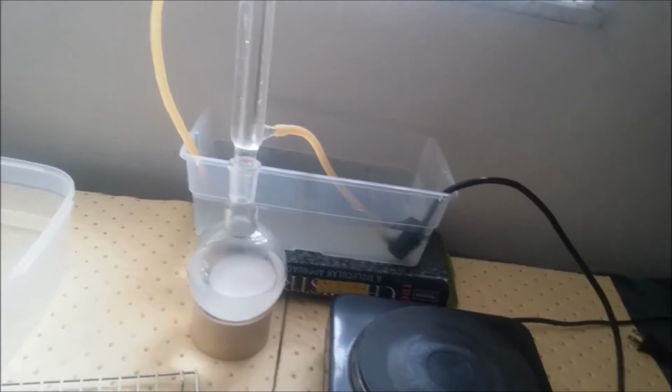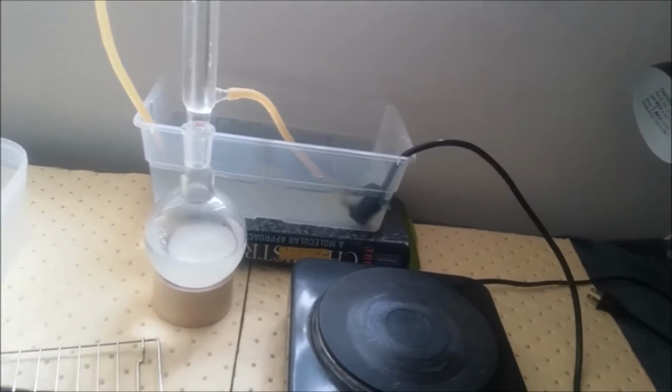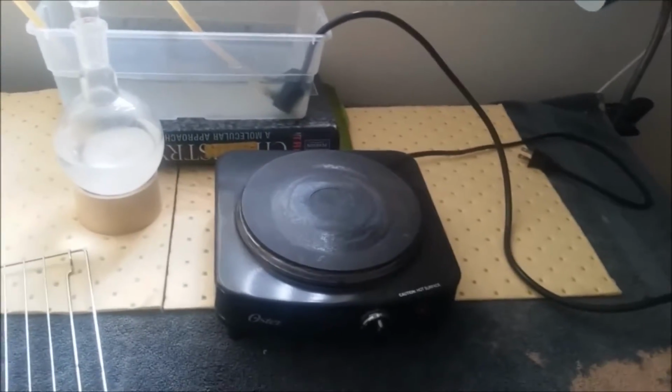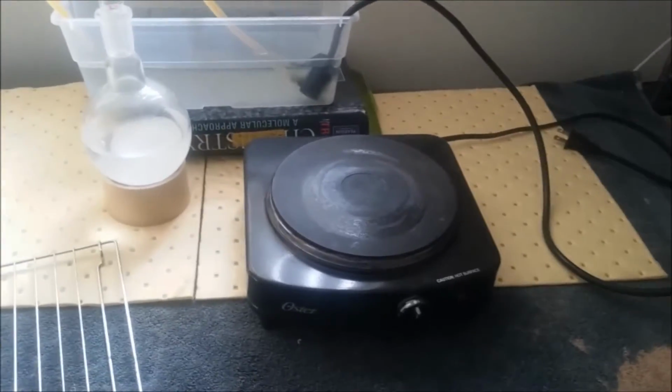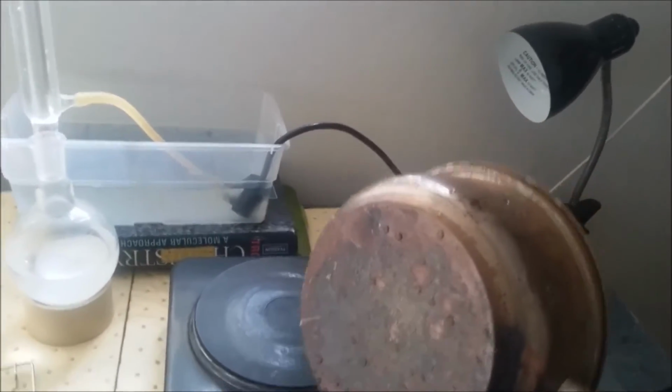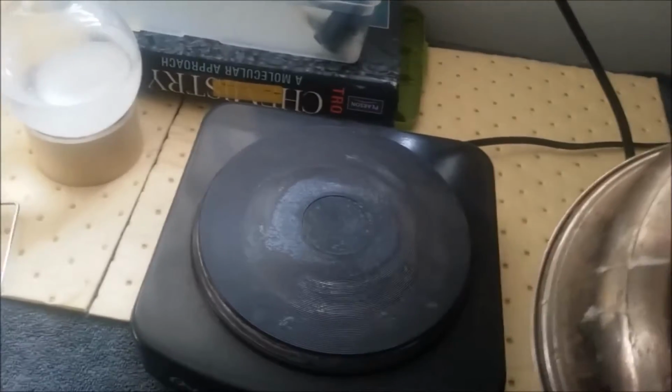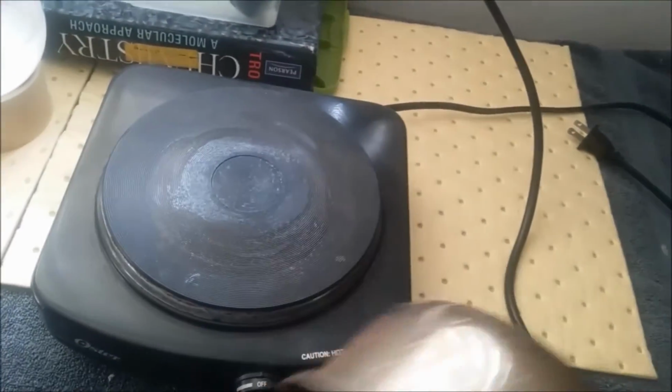Okay, so this is the part where I start screaming and cursing, more like crying and weeping. There was a profuse amount of smoke coming from my hot plate, and I forgot that the pan that I was using had some melted gunk on it from this yellow foam that I had accidentally forgot to scrape off before putting on here. I've been at this for like 10 minutes and it's not coming off now, nor is it coming off on the hot plate. I am not happy right now. I'm very sad.